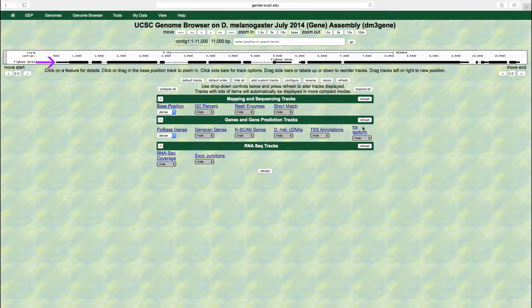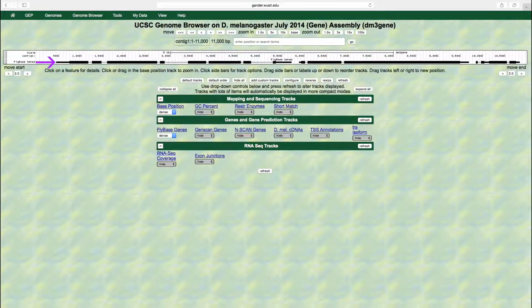To determine how many genes are in contig1, we will count the number of features in the FlyBase genes track. Each feature consists of one or more boxes, which correspond to exons.